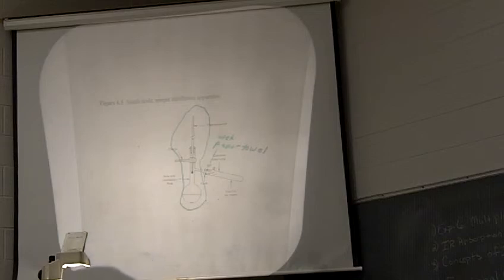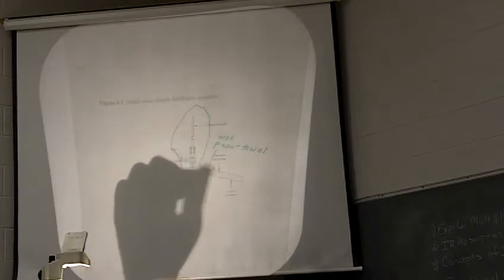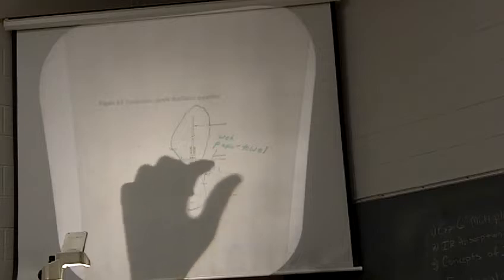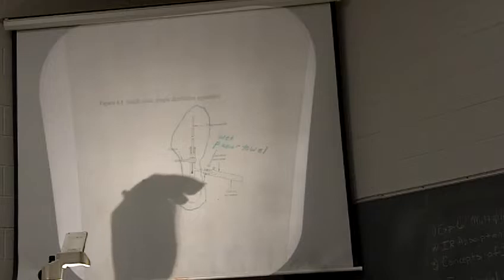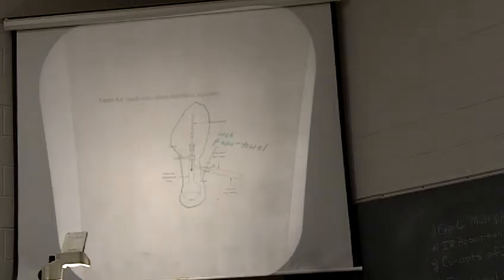And some of the liquid unknowns are really volatile, some of them are not. And so you want to make sure that after you've distilled it, you keep your unknown in a secure place where it's covered and not going to evaporate on you. Because if you run out of unknown before you get all the tests completed, that'll cost you 5 points as far as your report is concerned if you have to get new unknown. Okay, so you have to be really careful with it, not to lose it. All right, so we'll show you that setup in lab this week. Okay.